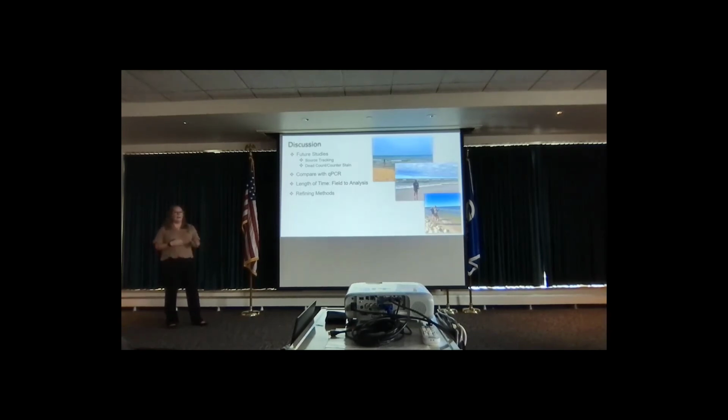We want to get back into that live-dead count to determine if the cell is alive or dead, because if it's dead, it won't make somebody sick. And we eventually want to compare it with qPCR. Like I said before, qPCR takes a longer time, but it does give a live-dead count. And we wanted to see if we could create a method that's faster, and hopefully we could get results in the same day. And then we're working on refining the methods right now, getting rid of some of the centrifuging, changing the incubation times, changing the temperature, just trying to make it more accurate and make it so everyone knows that it's safe.